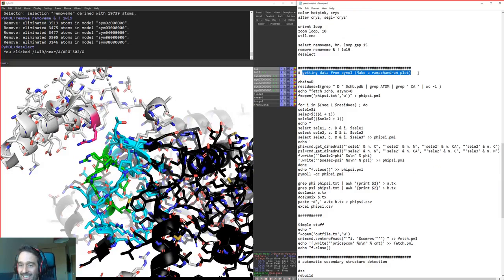How do you get data out of PyMOL into a text file? That was another question. So you're doing all these measurements all the time, and again, if you're doing measurements and you're putting this into some form of script, then it's very useful to be able to bring those measurements out without having to jot them down on a piece of paper or start copying and pasting.